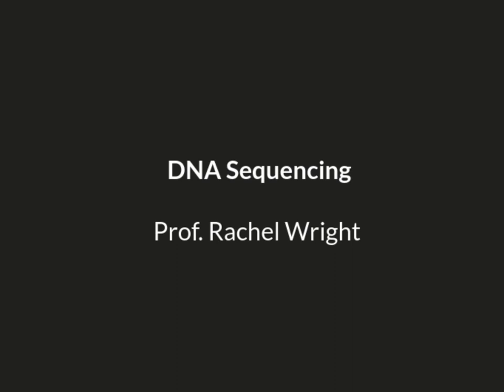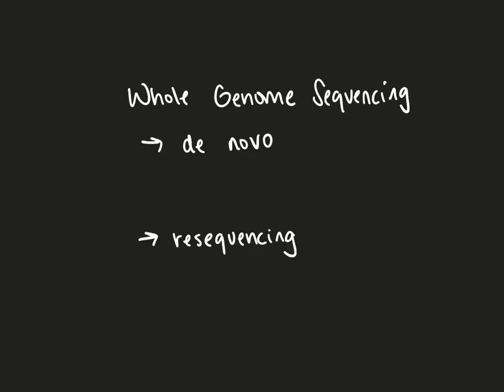In this video, I'm going to talk about DNA sequencing, and specifically I'm going to focus on whole genome sequencing. Whole genome sequencing comes in two flavors. First, there's de novo. This is if you're sequencing a genome for the first time. So here, de novo meaning from new, you want to sequence all of the genomic content in your organism. There's also whole genome resequencing.